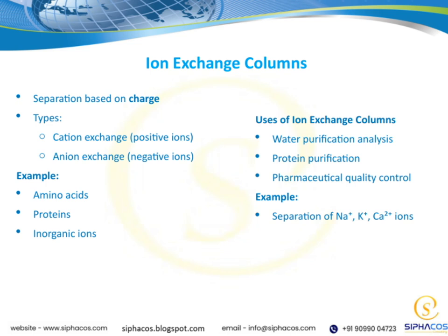Similarly, inorganic ions like those in water samples can be separated efficiently. So overall, ion exchange columns are a powerful tool in analytical chemistry, biochemistry, and environmental science, enabling us to purify, analyze, and control the composition of complex mixtures with precision.